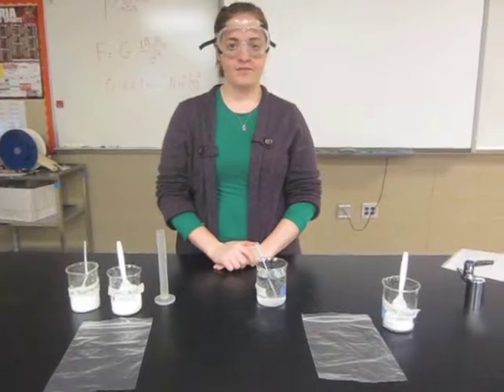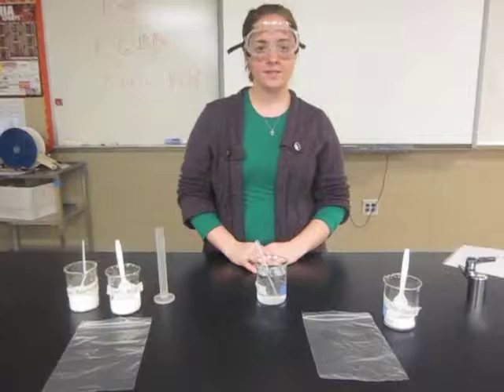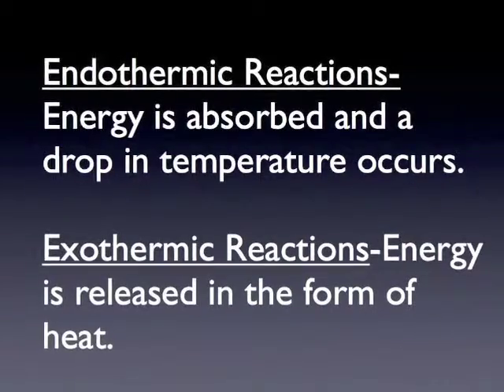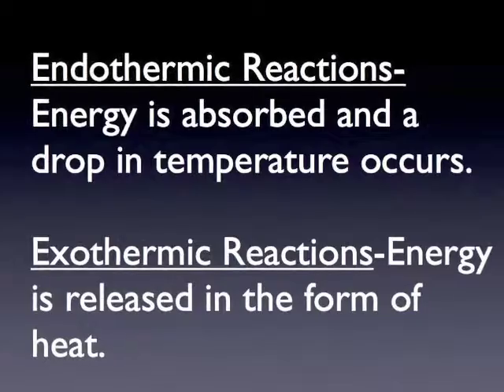In this lab, we will be investigating the difference between endothermic and exothermic reactions. What's the difference between an endothermic and an exothermic reaction? In an endothermic reaction, energy is absorbed and a drop in temperature occurs. In an exothermic reaction, energy is released in the form of heat.